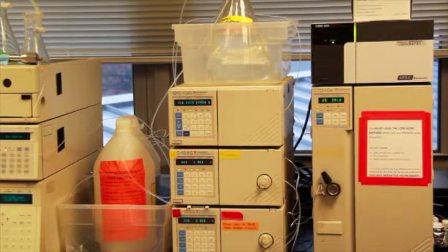As well, take a look at the how-to degas solvents video, because degassing solvents does take time. So you don't want to have everything prepped and ready to go and be waiting to degas your solvents.